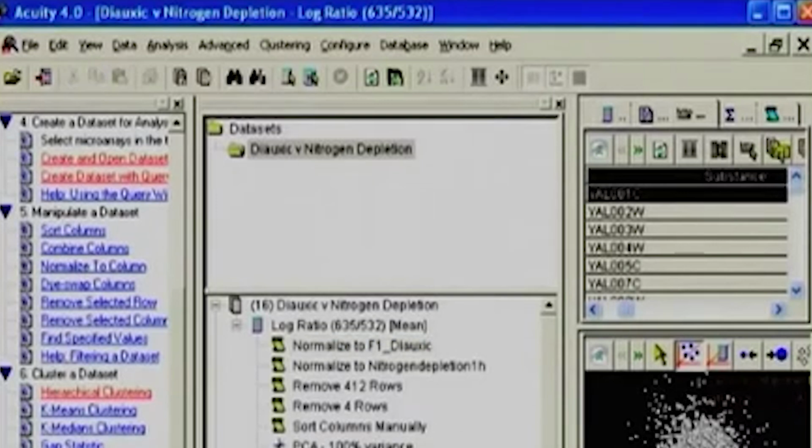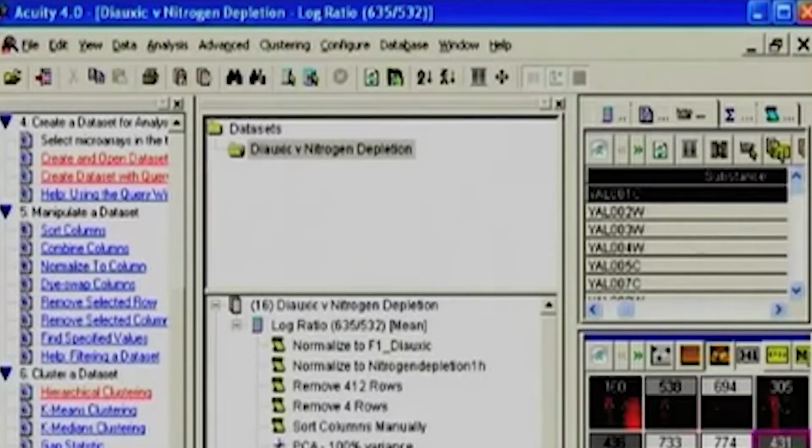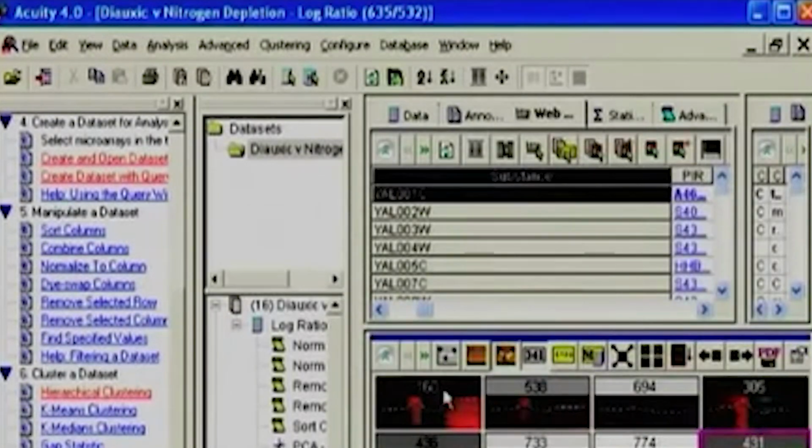So here when I look at SOM, which I have done at the level of 4x3 clusters, SOM is something like a non-hierarchical type, so they are individually being blocked. All different genes behave differently, and based on the profile they are made into one group. Because I have given 4x3, I will be able to see 4x3: 4 columns and 3 rows. So independently they are being divided, and one can have any number.